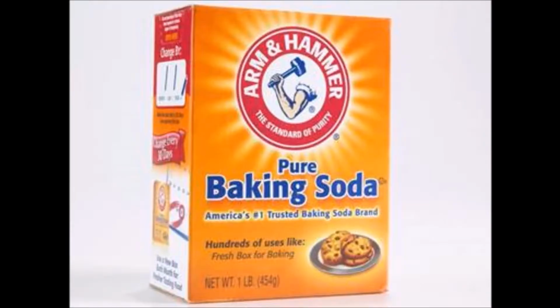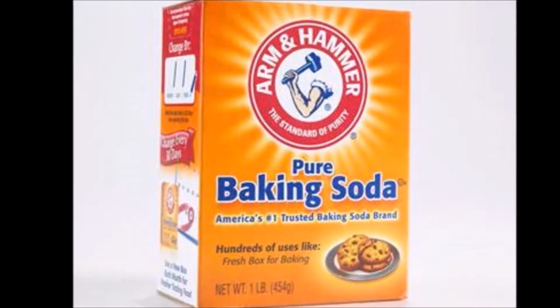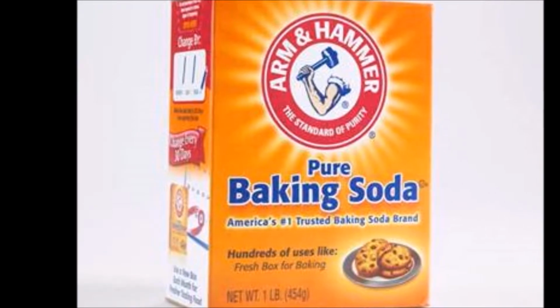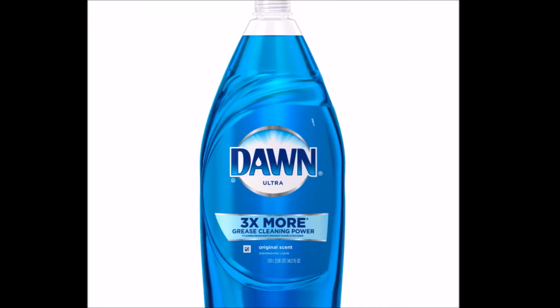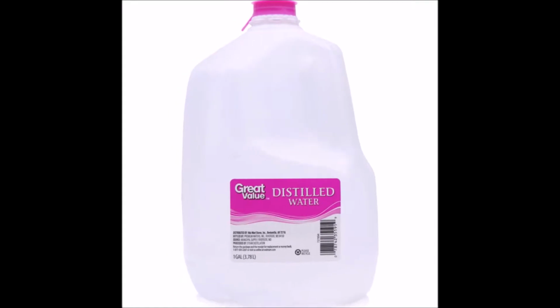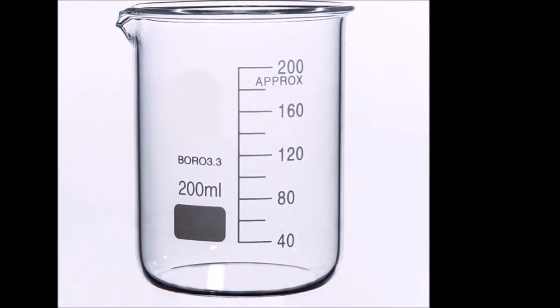Materials: spinach leaves, 8 grams of sodium bicarbonate, 1 gram being used in trial 1, 2 grams being used in trial 2, 5 grams being used in trial 3, and in trial 4, there will be no sodium bicarbonate as trial 4 is a control experiment. In a 200 ml beaker, 5 ml of liquid dish soap will be dissolved in 50 ml of distilled water. In each of the 4 200 ml beakers, 100 ml of distilled water will be measured.